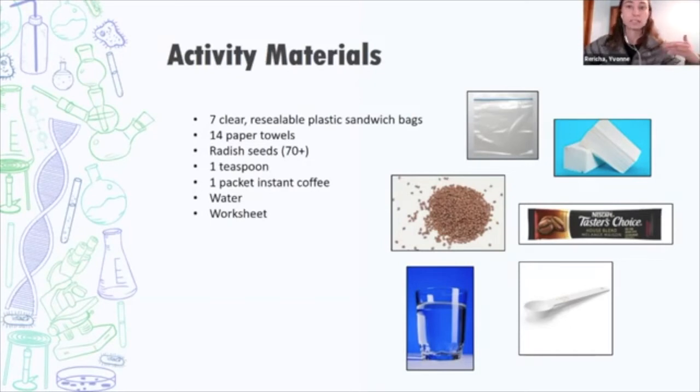The way we set up our activity, we had instant coffee as the substance that we included in the kits for the students to test. And then a teaspoon or measuring device, water, and then the associated worksheet.